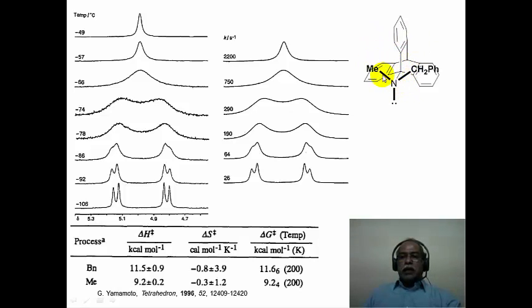So as it is, the molecule is chiral in the frozen conformation like this, when there is no rapid carbon-nitrogen bond rotation. So these two hydrogens on the CH2 become diastereotopic in nature. We are looking at the CH2 hydrogens of this molecule at low temperature, when there is no rapid rotation of the carbon-nitrogen bond. Because of the chiral environment present in this molecule, this CH2 appears as an AB quartet, because the CH2 hydrogens are diastereotopic in this particular system.